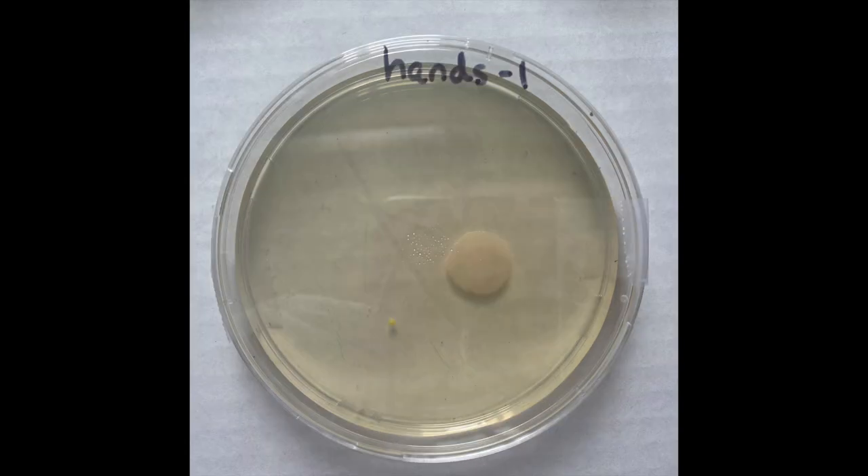Here we have our hands one plate, which if you remember is the swabbing of my son's hands prior to him washing them. Usually when microbiologists describe plates, they refer to the color, the texture, and whether a colony glistens or has a more creamy consistency. While you cannot identify the specific type of bacteria from its growth on a plate, you can tell from these differences that you have different bacterial colonies forming.